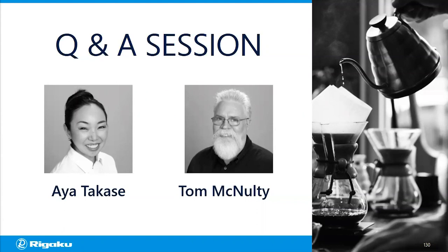Okay, next one, I'm going to translate this a little bit. I think the question is getting at which of the Rigaku machines are capable of using the machine learning capabilities that you went through? All of them. Because for the machine learning or deep learning part of the analysis, I'm using Dragonfly. And Dragonfly can load CT scans from any of the Rigaku systems. So you can use any of the three systems and use machine learning on the results.